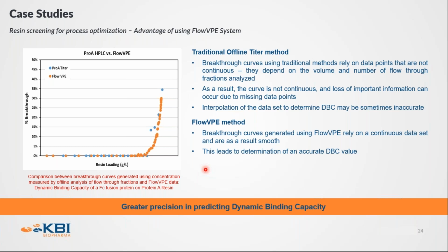Which decisions do you mean for production? So I think he's asking what decisions within production you see where we could use the FlowVPE. I don't have much experience with continuous chromatography, but we can definitely use it for real-time decisions when we are doing UFDF at large scale.